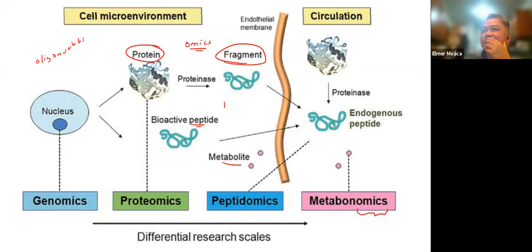Now, I remember, I think one of the things when I started doing my PhD, I tried to monitor the microbial activity in sludge. And I tried to compare before and after I applied a different method and see what's the difference. And I was able to see that there's some fragments that come out when metal was applied. And we're trying to deduce it as some stress protein that counteract the application of metal. Okay, but the number one thing that I use in my experience, the mass spectrometry, is for environmental analysis.